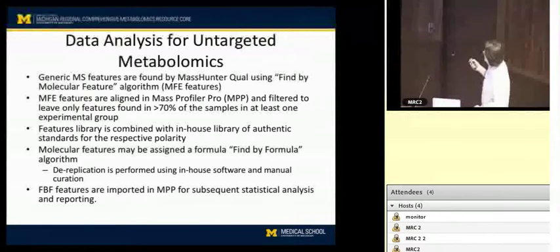In other words, are there some no-brainers, things you definitely want to watch out for when you're starting to look at untargeted metabolomics data? For example, how do you know, if you have two very closely related metabolites, that you've got the right one? We'll talk about that in a future slide. And then we're going to go on and do some later statistical analysis.